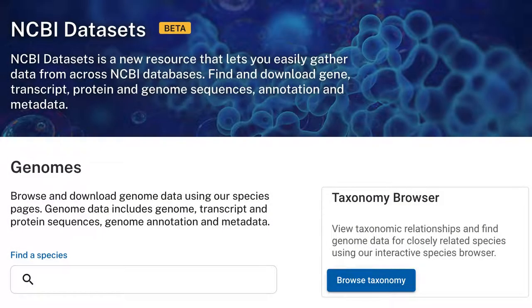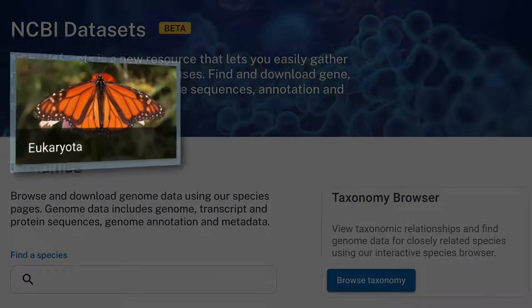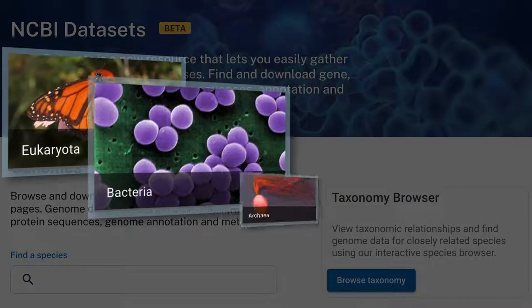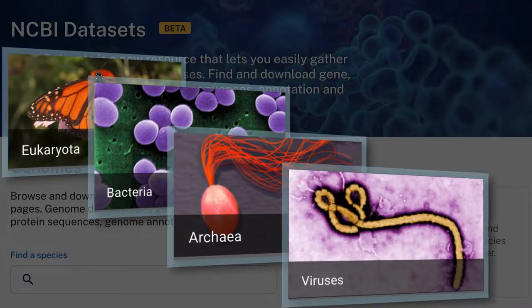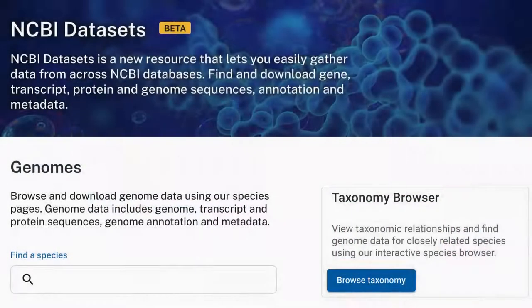NCBI Datasets is a developing resource that lets you easily find, browse, and download data at NCBI. In this video, we'll show you how you can use our new web pages to find genomic sequence and metadata for your organisms of interest. We'll focus on recent improvements for searching genome and gene data, and we'll use RAT as an example.